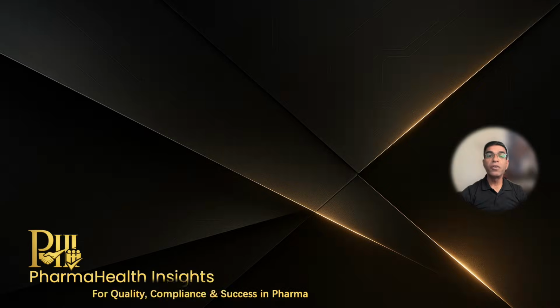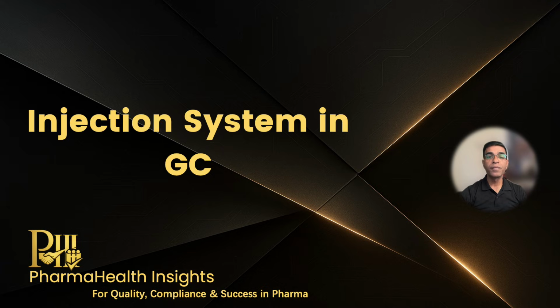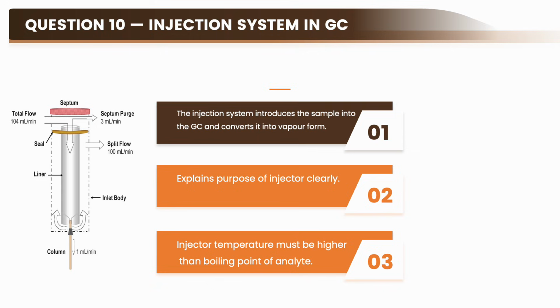With this, the interviewer will shift focus to how the sample enters the GC system. And the next question will be, what is the injection system in gas chromatography? You should always answer like this.